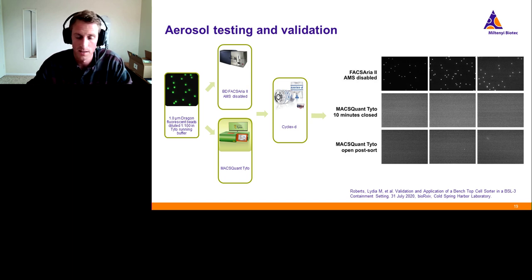In all fairness, the aerosolization mitigation, I can't think of the name, the AMS system was pulled off of the ARIA. So I don't think this is a totally fair representation of aerosolization on the ARIA.